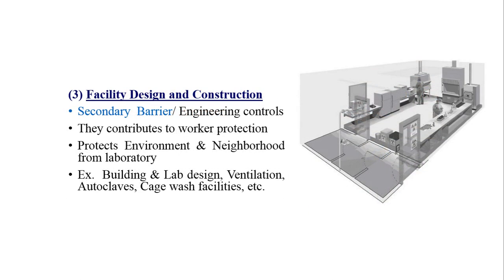The third important part of biosafety is facility design and construction, also called secondary barriers or engineering controls. Safety equipment is the primary barrier, while facility design is the secondary barrier. These protect workers and the surrounding environment from the laboratory. Examples include building and lab design, ventilation, autoclave, cage systems, and other lab facilities.